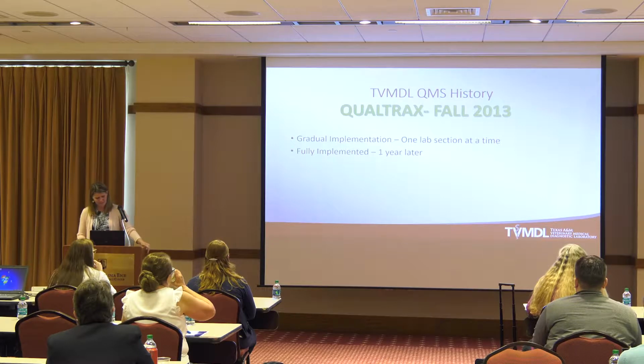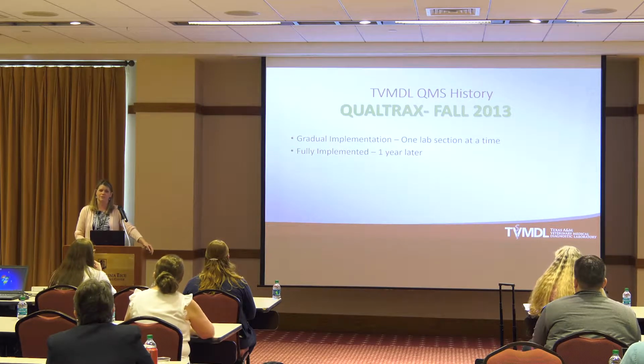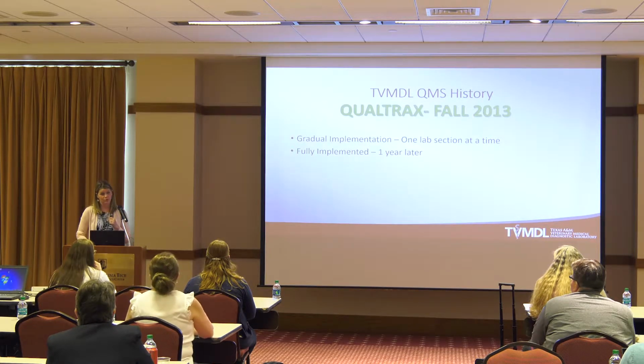So how did we implement it? We decided to do a gradual implementation. We actually put one section in at a time. So I listed those sections earlier, those different testing disciplines. We imported one section at a time. So each section has their own SOPs, their own worksheets. We put one at a time in, and it took about a year. So we were fully implemented in a year. We decided that was the best approach.